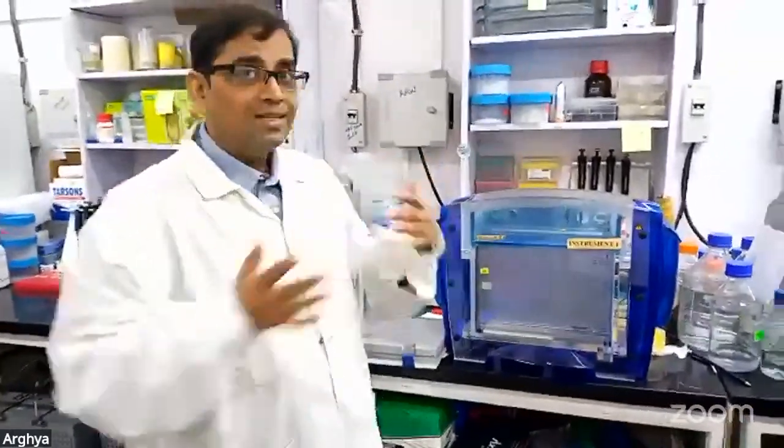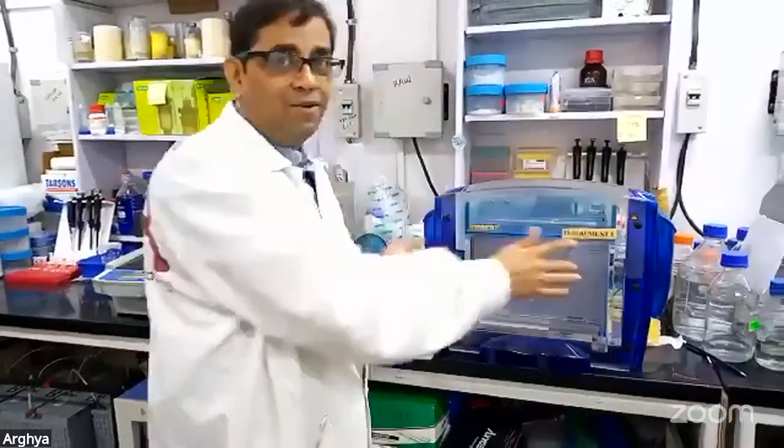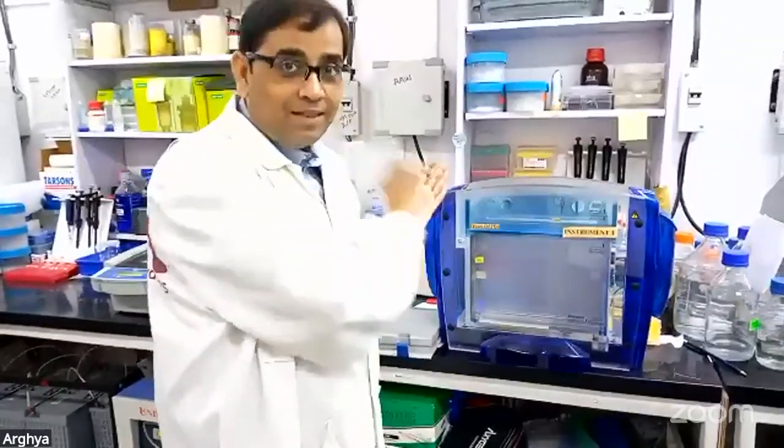So running these 6 gels together is actually a very difficult task, because first of all, casting the gel. I'm sure many of you have failed already with the 7 centimeter small gel to make SDS-PAGE properly. And now if you have to cast 24 centimeter long gels, not 1 but 6, then that becomes really good practice.